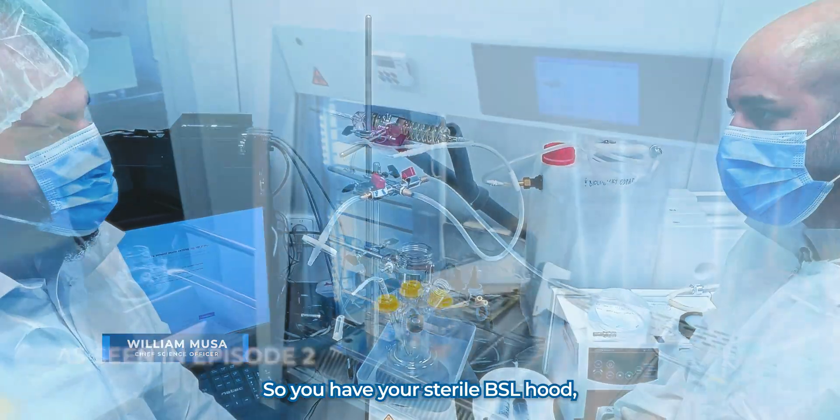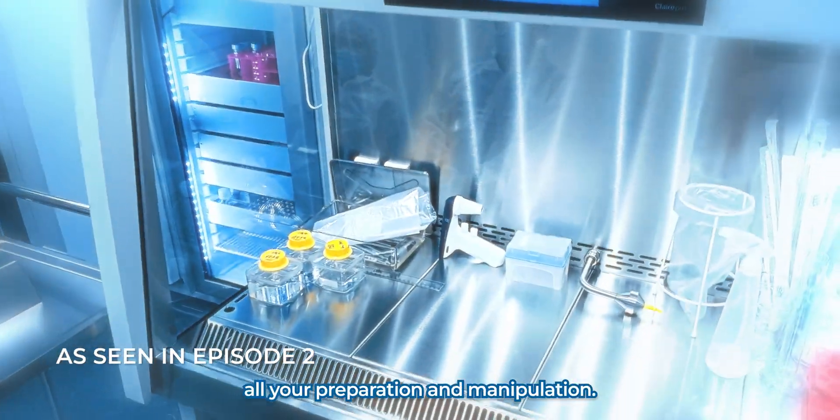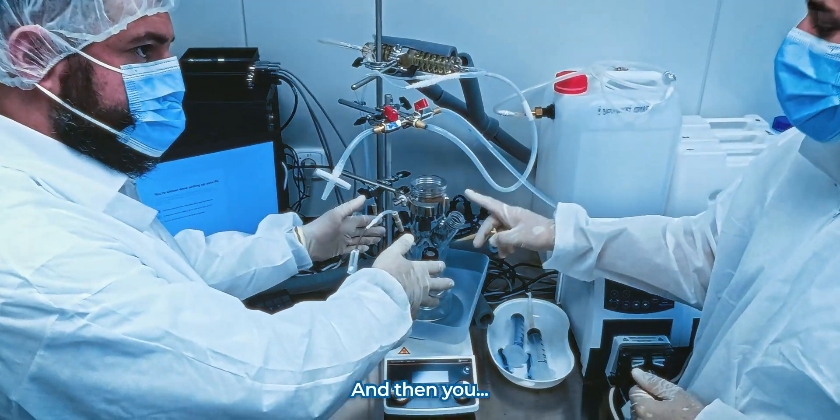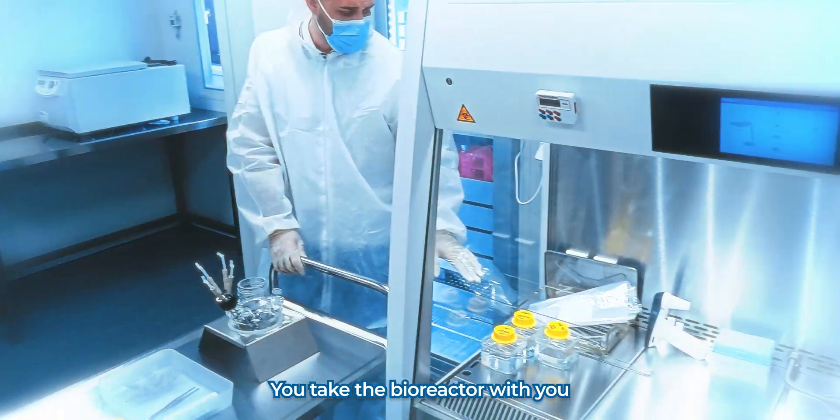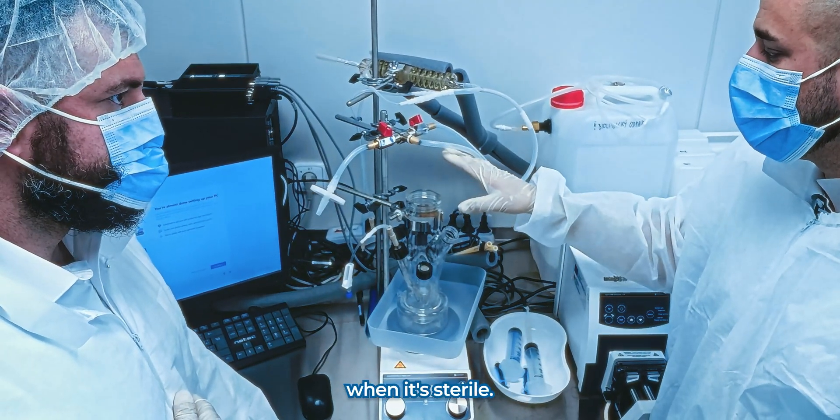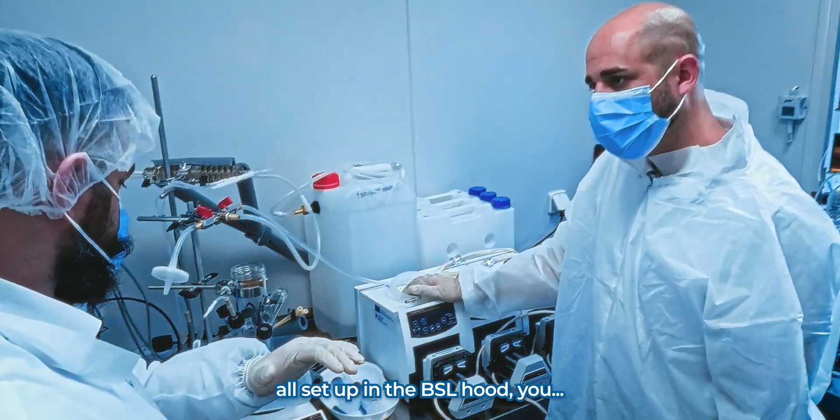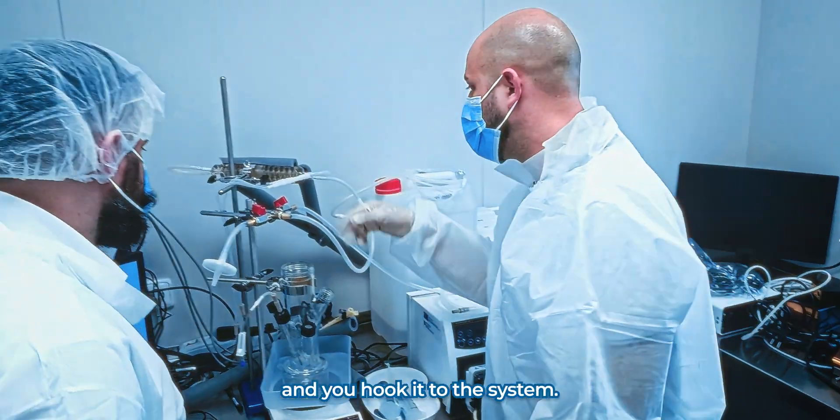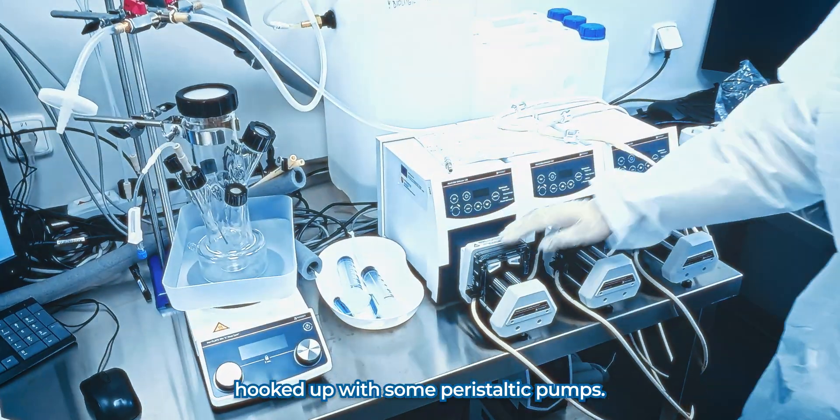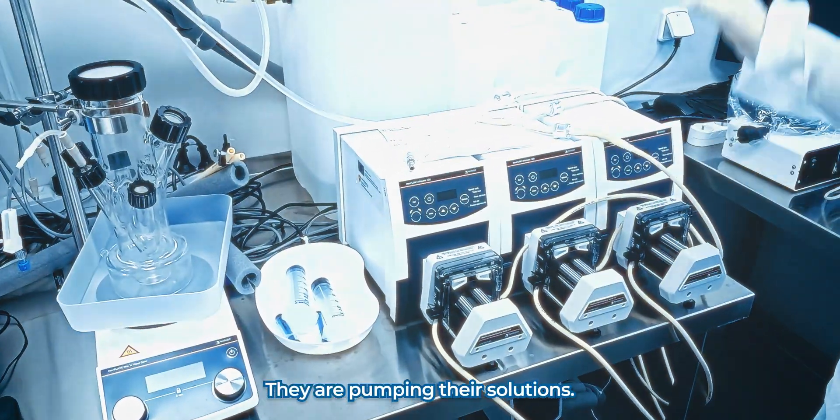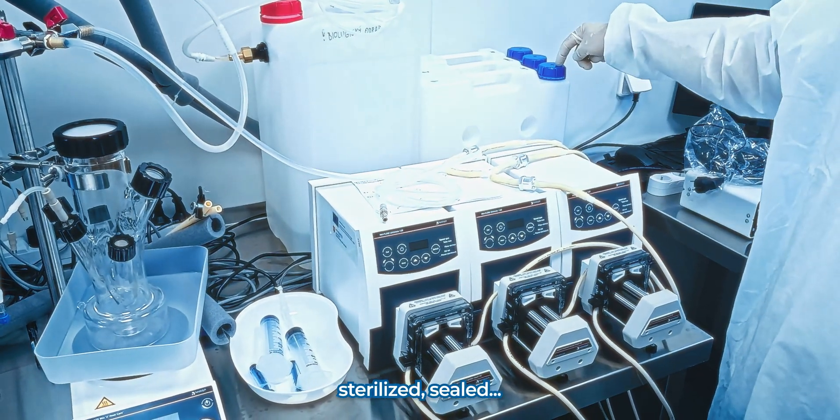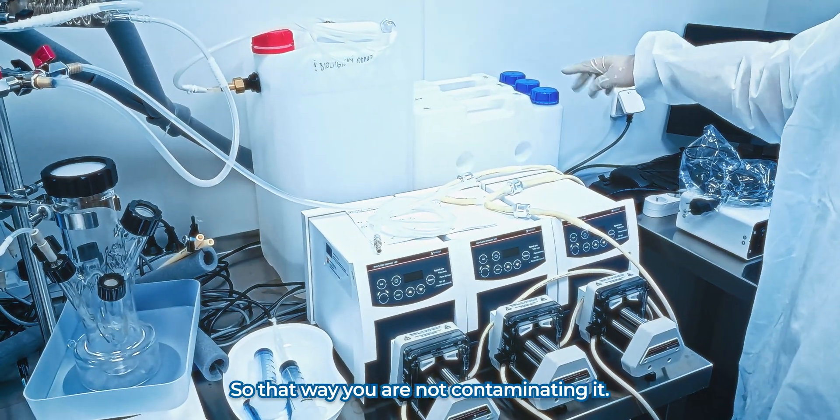So you have your sterile BSL hood where you can do all your preparation and manipulation. And then you take the bioreactor with you to the hood because you need to seal it when it's sterile. And then once you're all set up in the BSL hood, then you go here and hook it to the system. So the solutions need to be prepared, sterilized, sealed on membranes, so that way you are not contaminating it.